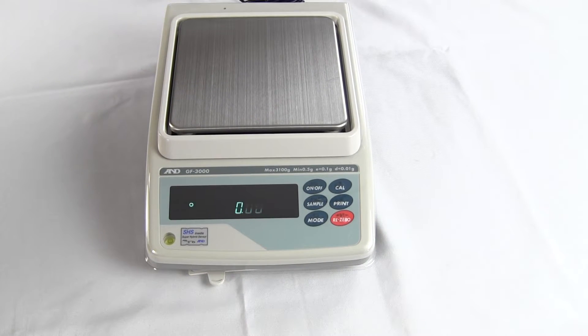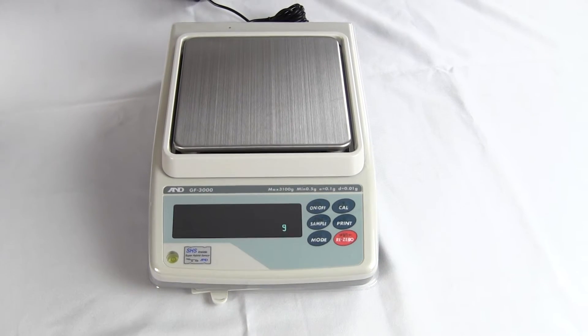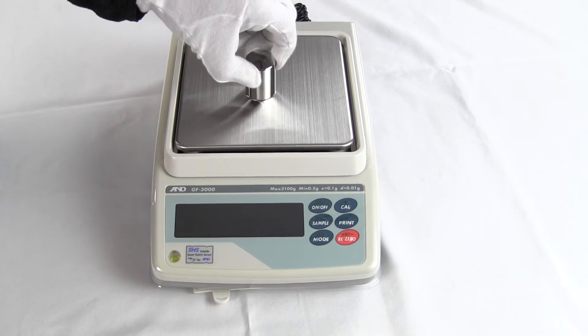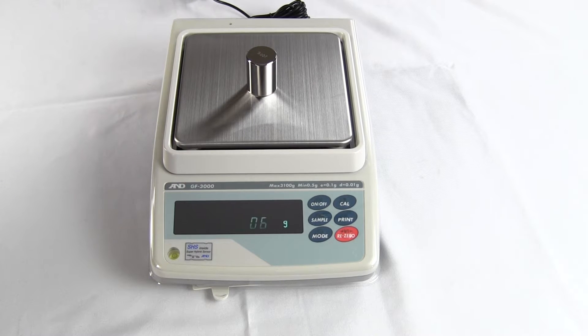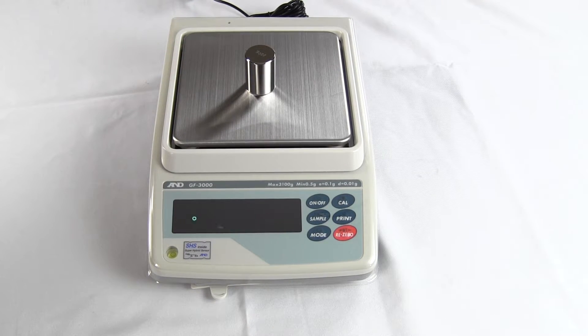Welcome to Precision Weigh and Balances. Today we'd like to show you from A&D the model GF-3000. This balance offers 3,100 grams by a hundredth of a gram — that's 0.01.